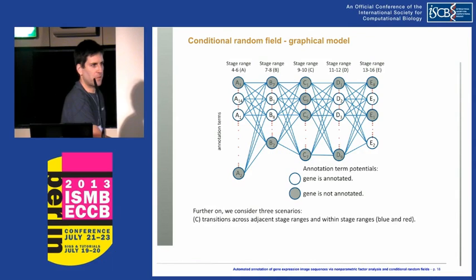Yeah, so the feature extraction method is quite fast. If I remember correctly, what we published said we had about 2,000 genes with around 10,000 images, and extracting features takes within 2 or 3 hours. We usually do this offline anyway, so it was really not a concern. We wrote this in MATLAB. Of course, you can speed it up in C or Java or something else, but that was quite decent.